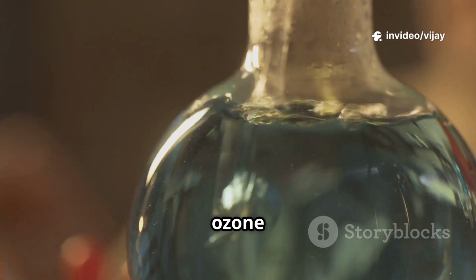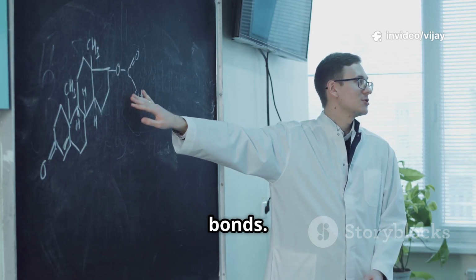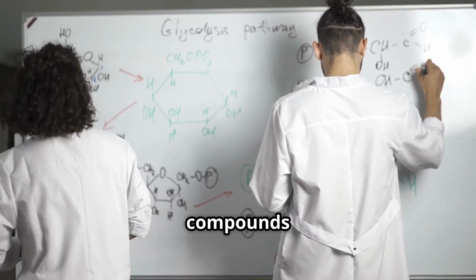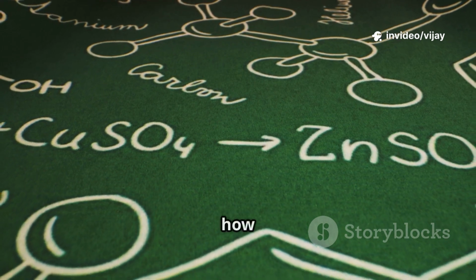It's a reaction where ozone gas, O3, slices right through carbon-carbon double or triple bonds. That's your alkenes and alkynes. By doing this, you end up with carbonyl compounds, things like aldehydes, ketones, or carboxylic acids, depending on your starting point and how you finish up.